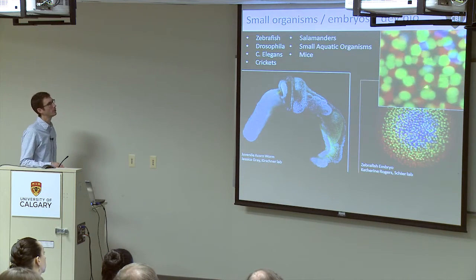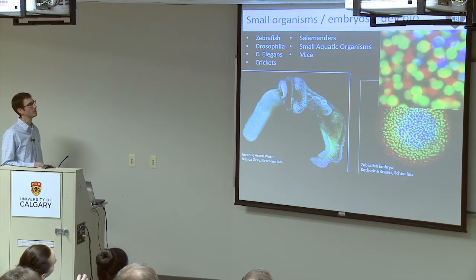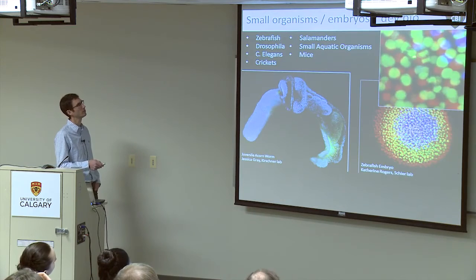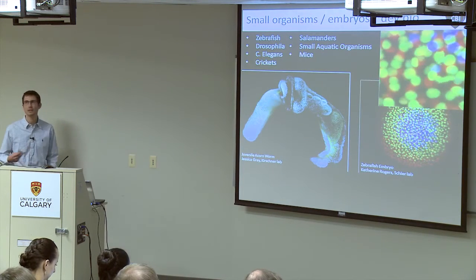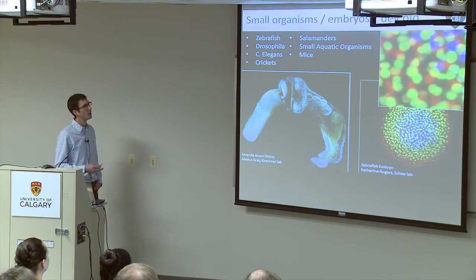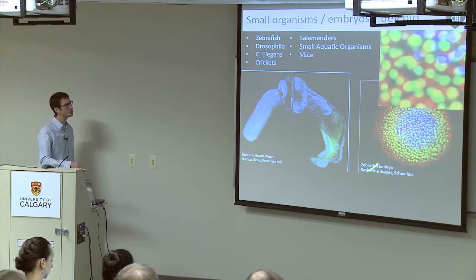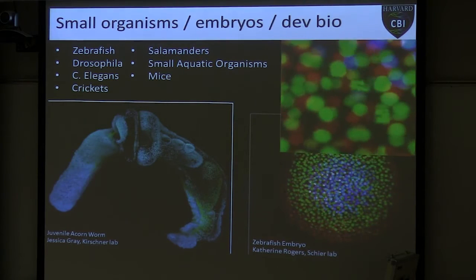And in the zoom in here, you can sort of get an idea of what the resolution of this is. This is just an H2B tdTomato construct so that you can see histones. You can actually see some of these cells, the DNA condensing and dividing. So it is a pretty good resolution system. Obviously not quite what you'd get with confocal, but pretty close. And this is just depth coded, so the cells at the back are red and the cells closer to the objective are blue.